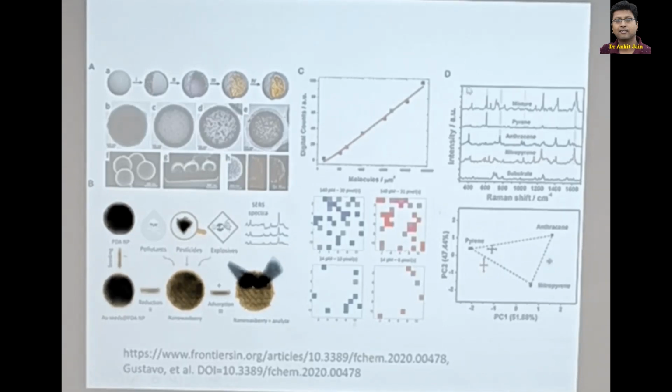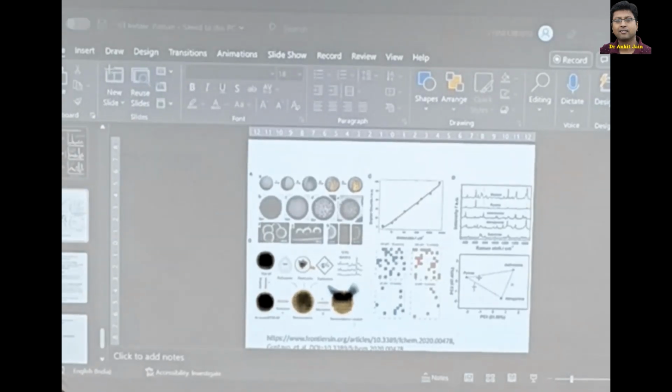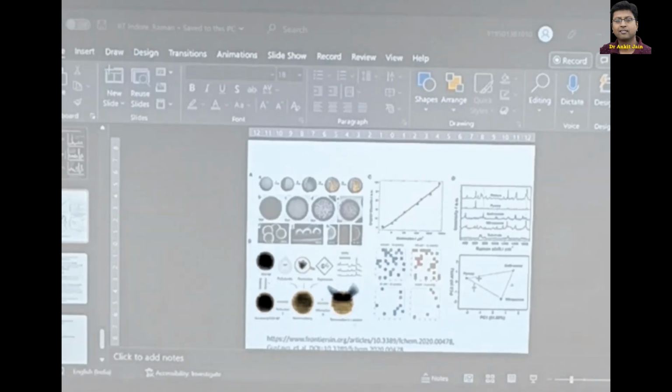But if you start with the mixture and want to backwork, that is a bit difficult. Because with biomolecules, you have a lot of different things, lots of enzymes, and backworking from there is very difficult. But it is doable if you have a proper library made for all the different components using Raman, and then you can do it.